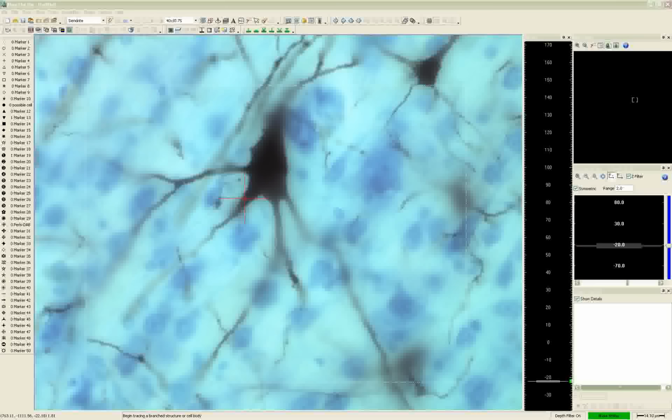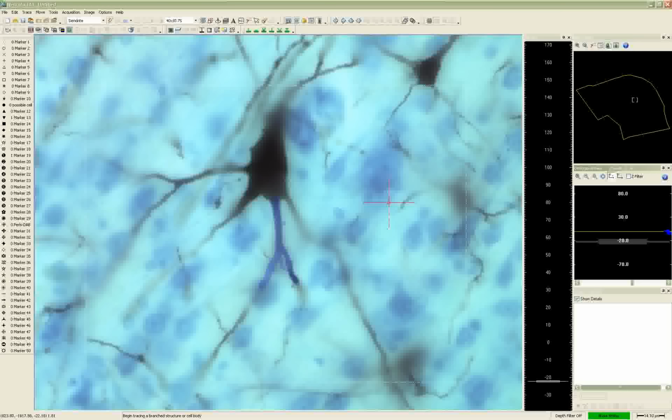The other nice thing about Neurolucida is that you can resume tracing at any point. So if in your initial analysis and your comparison between structures or cells, you see a difference in the branch structure, which you did initially trace, and that leads you to wonder if there are any differences in the spine density along those branches that you've traced, you can then go and add those spines at a later point. You just have to make sure that you're at the right Z position before you start tracing so that everything stays in registration. Okay.